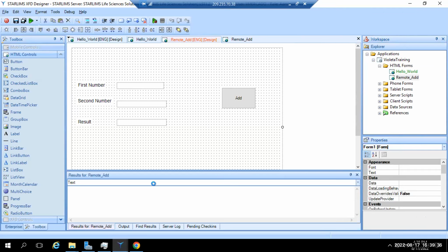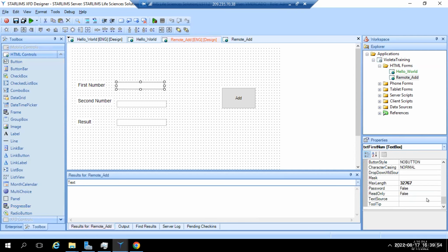We're way over. Ronald, yes. I have a quick question. Tell me. Is there a difference from writing text to looking it up like Violeta did? No, it's exactly the same. Just be careful with your names, right? I tend to forget what I call my variables, so I use the IntelliSense. Once you get more practice, you start typing and then control space, and then you use the keyboard shortcut, find it, hit tab, keep typing. You'll find what works for you, right? But it takes practice, right?